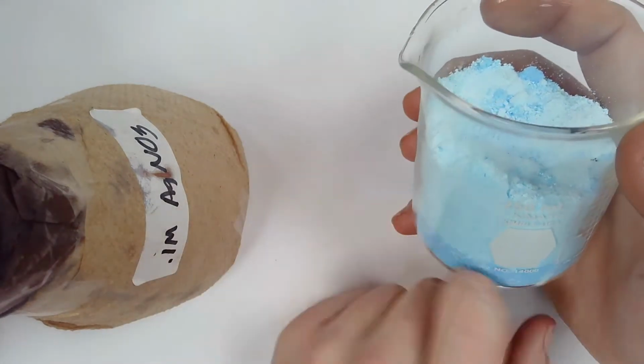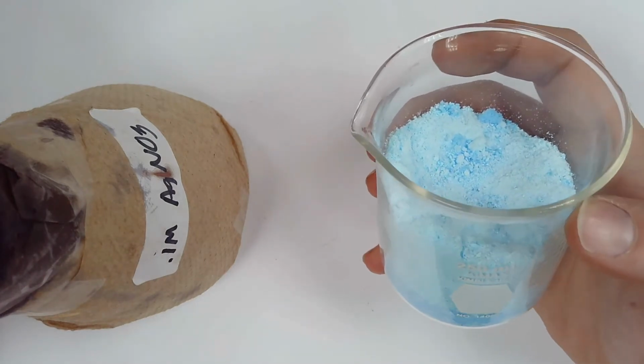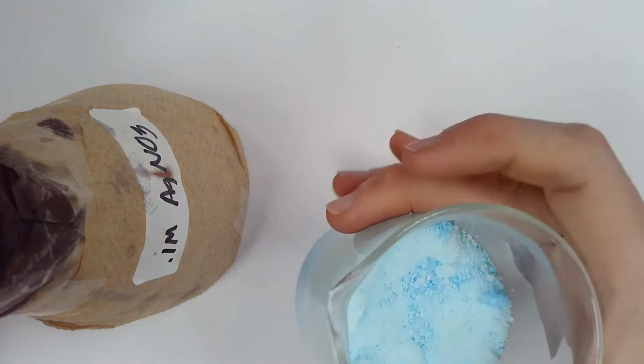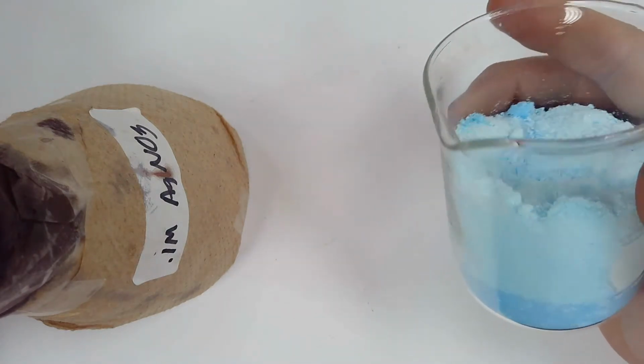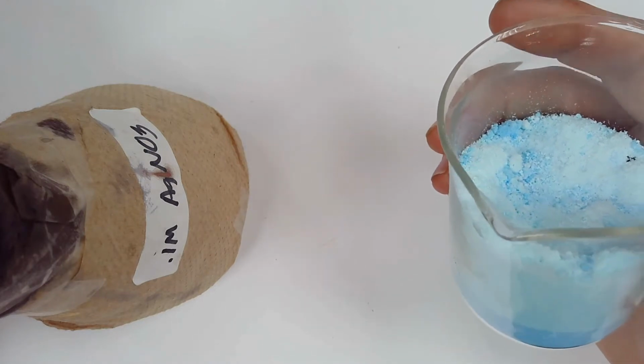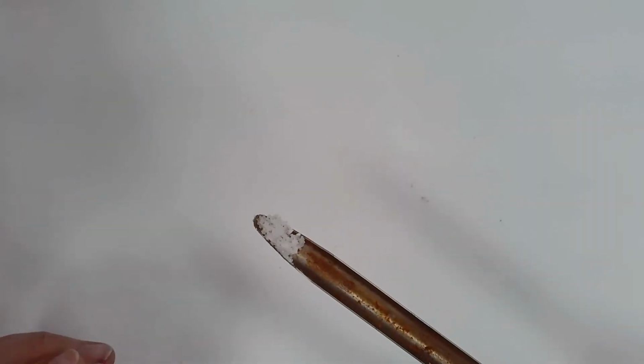Okay, so I need to make aqueous solutions of all of these. And the concentration doesn't really matter. Now, you don't actually understand what concentration means to a chemist, but you can think about the amount of this per milliliter of water as really kind of insignificant to my end result. So let's go ahead and prepare a simple solution of, I don't know, let's start off with the sodium hydroxide here. All right, so there's some sodium hydroxide.